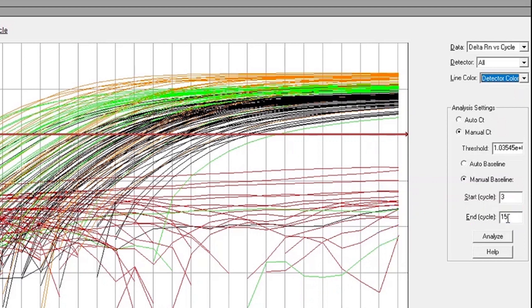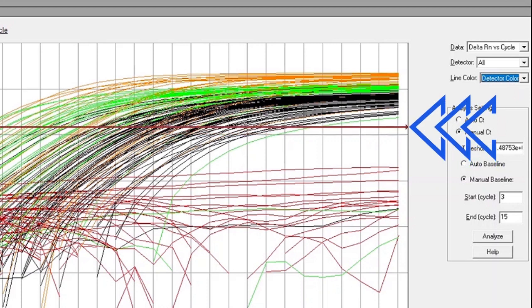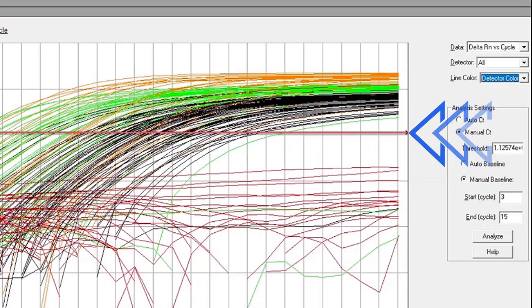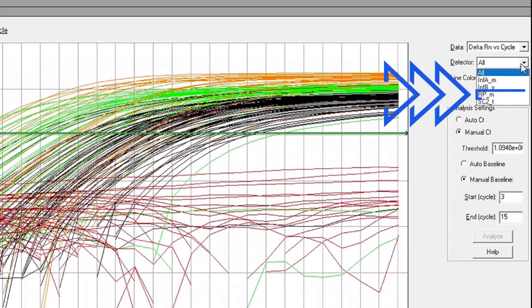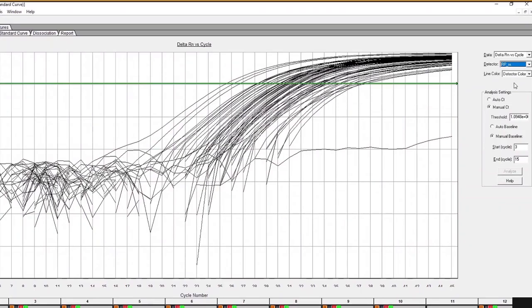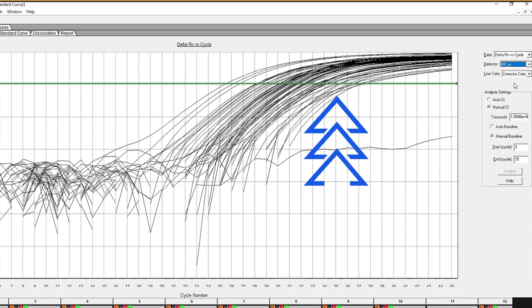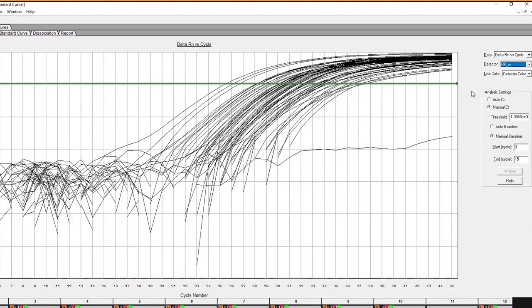To analyze the FLU SC2 multiplex data accurately, thresholds must be set by assay. If a single threshold is set for all four assays, data analysis may be impacted, leading to incorrect data interpretation. For example, if we set one threshold across all four targets and then look at the individual target data, we see that the threshold line is set too high for the RNAs P signal.